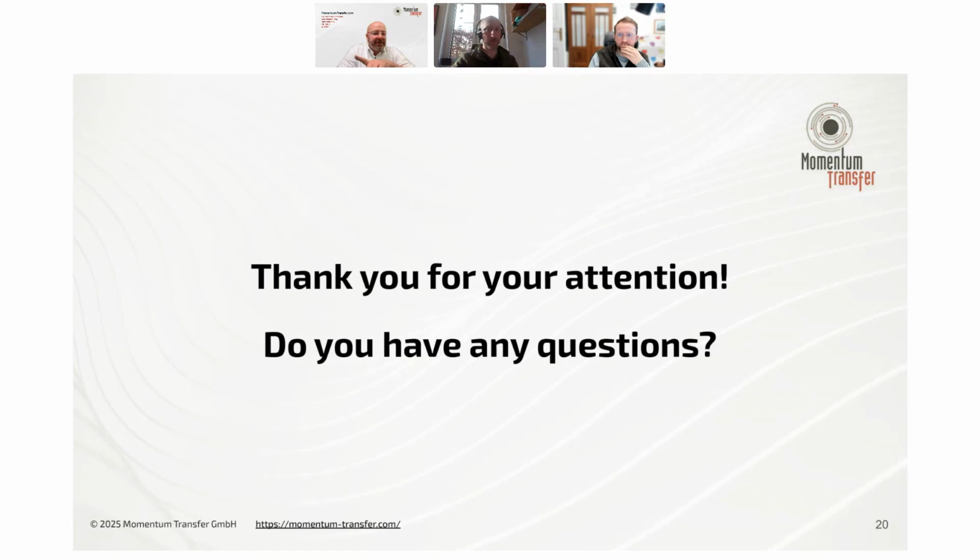I wanted to say, right, definition of thin film, right? You have monolayers, yes, no chance, right? But 100 micrometers, well, 100 microns is not a thin film, if we go by the definition that thinness means the properties of the material change. Well, I heard you. I have come to expect the unexpected, so I always ask, what is a thin film to you?